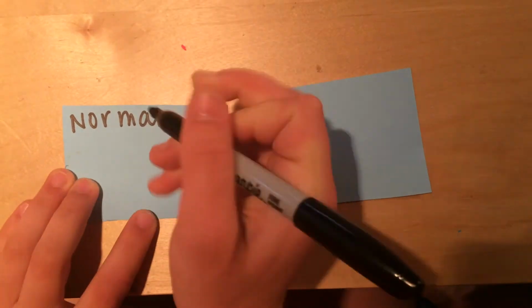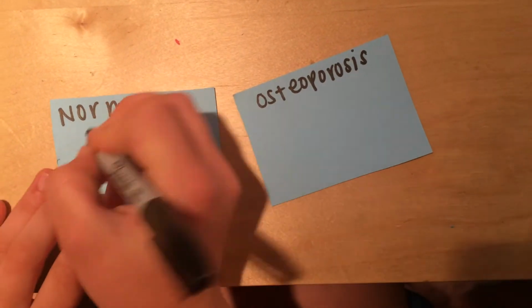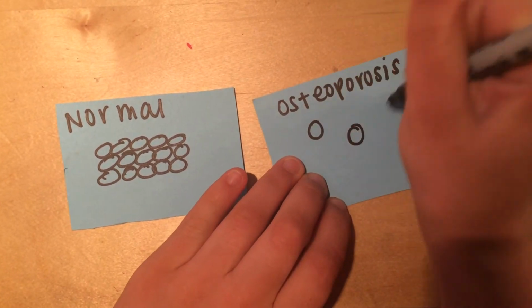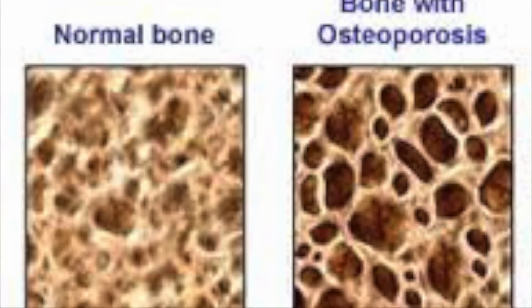Histology can be used to identify a variety of diseases, one being osteoporosis. During osteoporosis, the trabeculae of the bones break down and bones become brittle. This leaves bigger holes in the circles of the cancellous bone and compact bone in the slides.